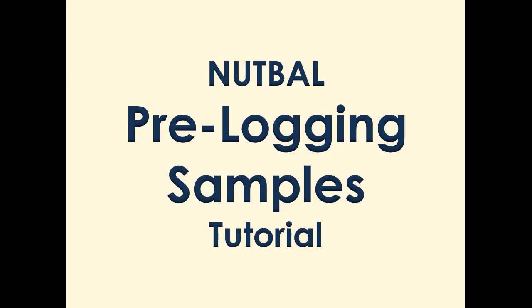This tutorial will show you how to pre-log samples into the NUTBAL system. Prior to or after you collect your manure sample from the field, you can pre-log samples into the system so that you do not have to fill out the paper sample sheet. This will also reduce the time it takes for your sample to be processed by the GAN lab.